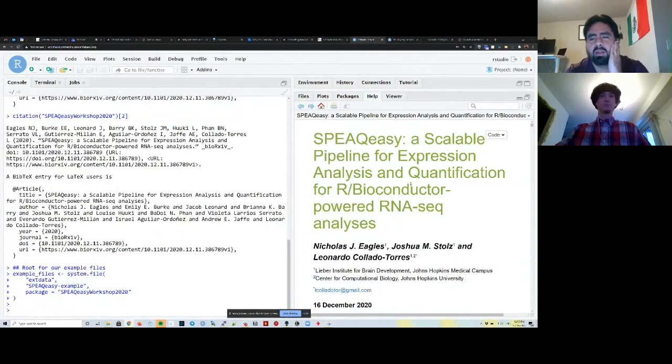With that, I'm going to let Nick explain most of SPEAQeasy. This workshop was going to be taught by Nick and Josh, but I'll be doing mostly Josh's part because he's not feeling great, although Josh is still around today in case you have any specific questions for him. Thanks so much, Leo, and thanks to the hosts for allowing me to speak at this conference.